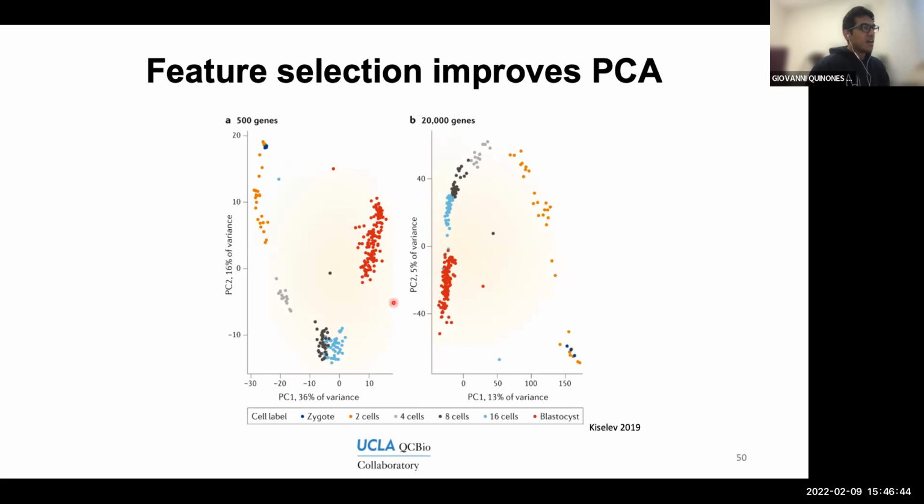However, we can see that once we run our PCA on our data, we'll be able to nicely plot it into a two-dimensional space. So originally we had something around 13,000 genes, I believe. So originally we'd need a plot with 13,000 axes in order to visualize our cells. But thanks to PCA, we can use PC1 and PC2 in order to get a two-dimensional plot.